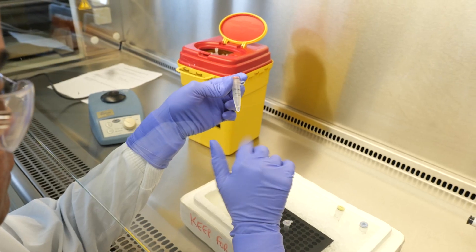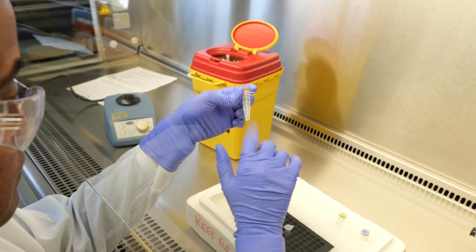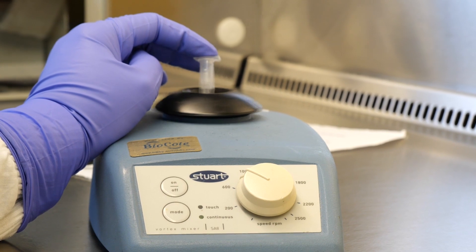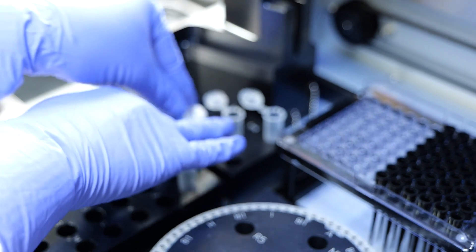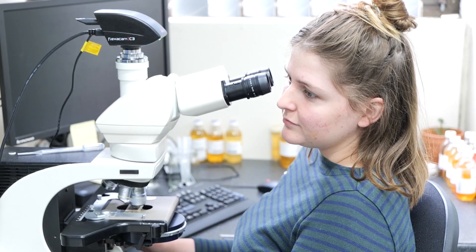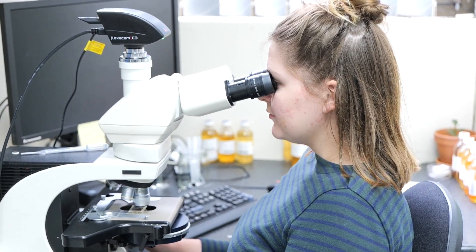At Sydney Water, we're very progressive in terms of women and what they do here. At the Sydney Water Laboratories, we have about 110 women, which is actually 50% of the workforce. They work on a variety of things, from COVID to water quality testing to microbiology and wastewater testing.